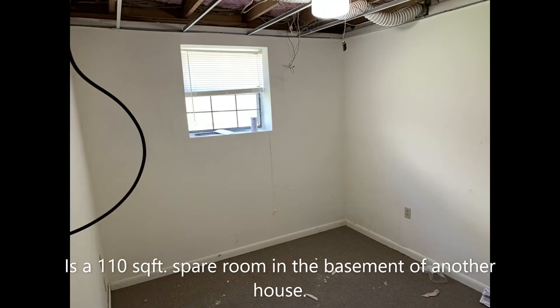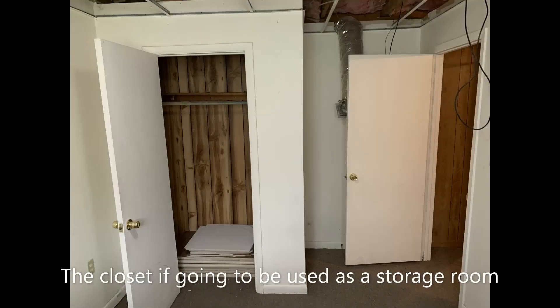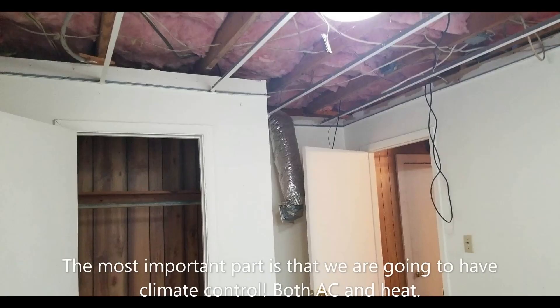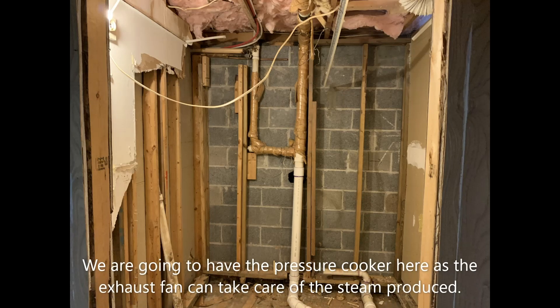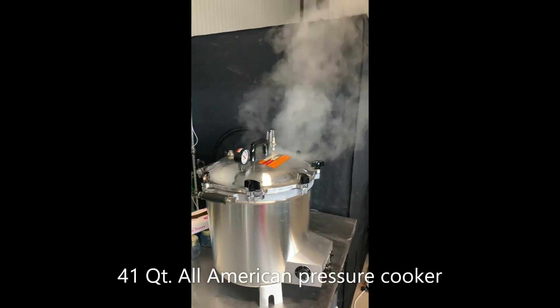We're starting off with a 110 square foot spare room that we'll be turning into our main lab, and we'll be using the closet as a storage room. The most important part is we're gonna have AC and heat — climate control. The bathroom needs a little TLC, but the great thing about renovating is you can always do a two-for-one deal. The bathroom is also gonna house our pressure cooker and have a great exhaust fan to take care of all the steam.